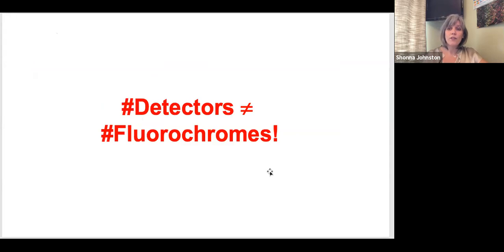Although one of the good things about it is obviously you've got more data points. So you should have a more accurate mathematical calculation of the fluorochrome signal, which is good. And possibly because of the extra photons that are collected across the spectrum, you would like to think that we might get some tighter clustering in there as well, which would be great.